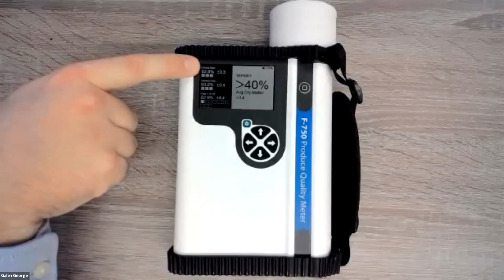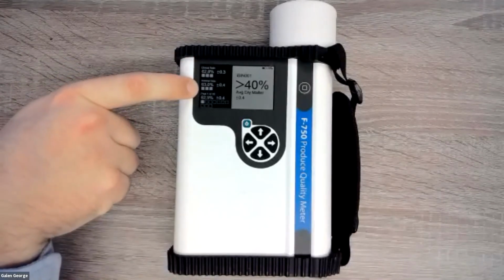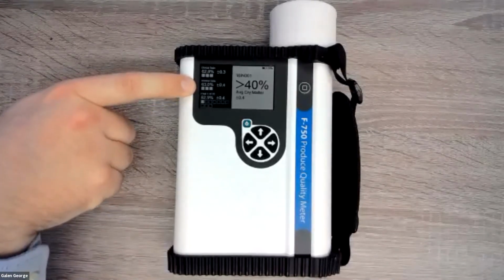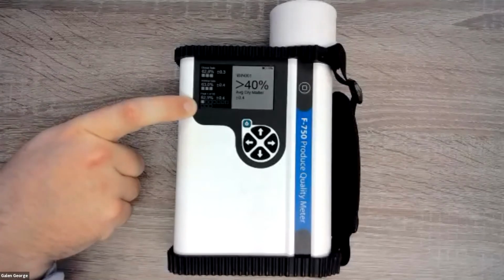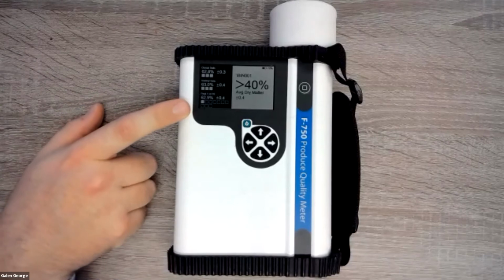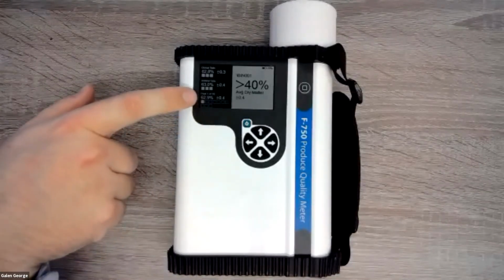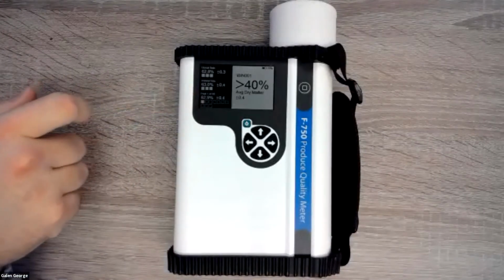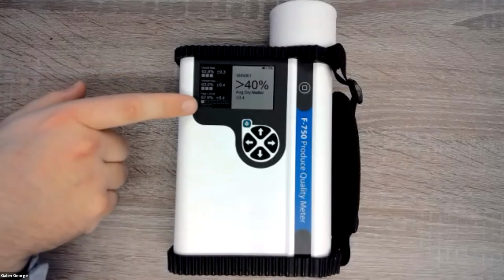I took a measurement of the dorsal. It automatically took 3 measurements. There's the ventral side. It automatically took 3 measurements, and it has the average and the standard deviation. And then down here, once I was done taking scans of both sides, it filled in a block for the fruit. Right now I have it set to 10 fruit per bin. So there's 10 blocks. Each time I scan a fruit, a new block will get filled in, and it'll give me the average for that fruit right here.